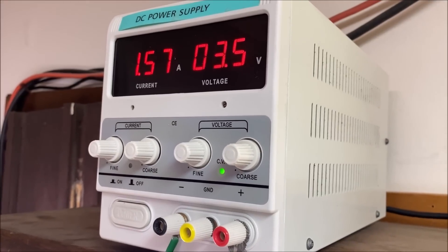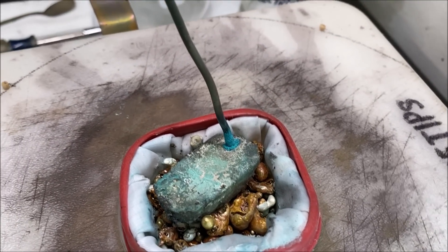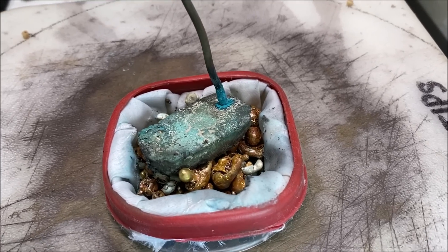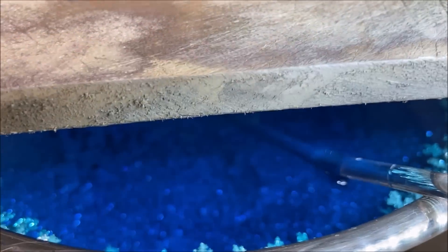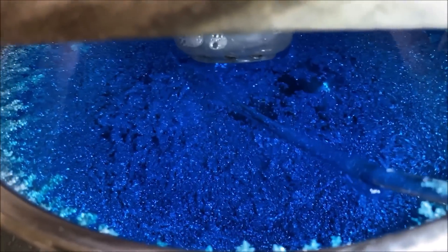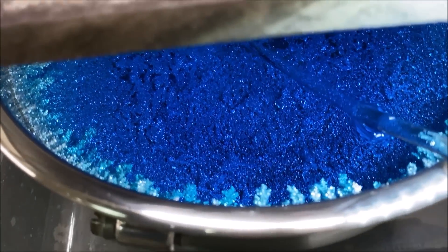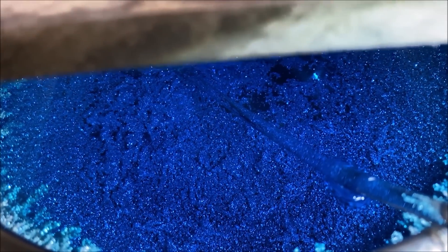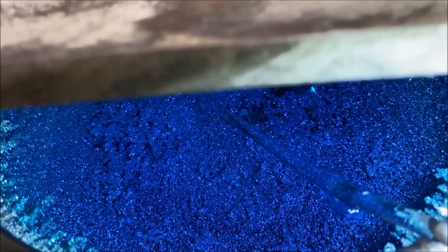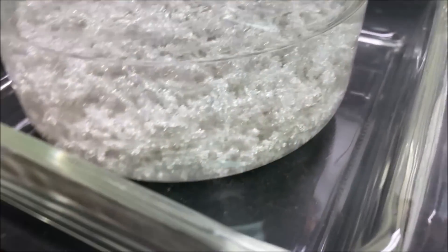We pass an electric current of 3.5 volts DC through the impure silver in the anode basket. The electric current dissolves the silver, and the silver ions travel through the electrolyte — which is made of silver nitrate — here in the silver cell. Silver plates out as high purity silver crystal on the inside of the silver cell. The cathode is a stainless steel bowl. After about 10 days we get some high purity silver.